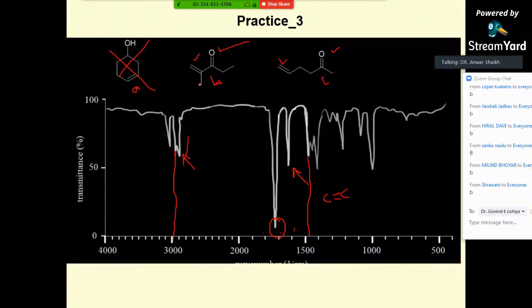If you see the case of B, there is one phenomenon occurring here. I will just draw it, and you will get very quickly what that phenomenon is. It is possible in B, and not possible in C. What is this phenomenon? Very correct, it is resonance.